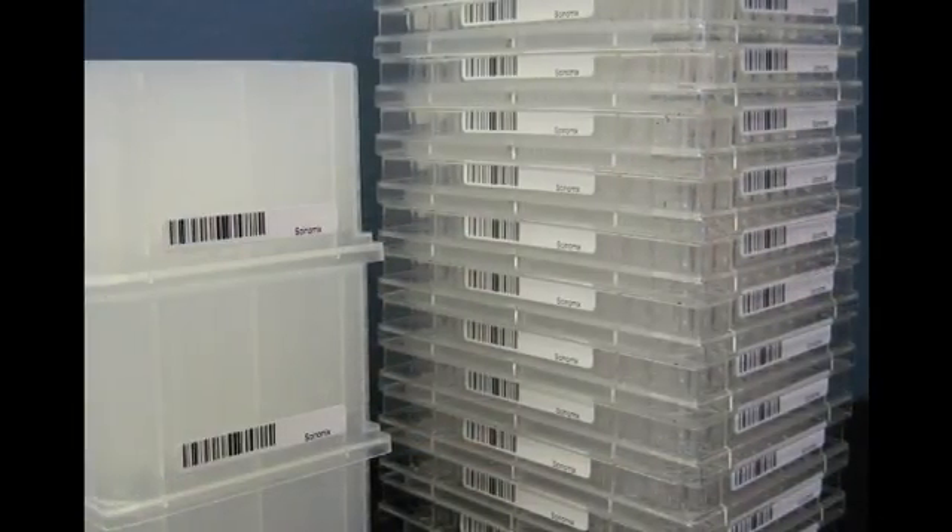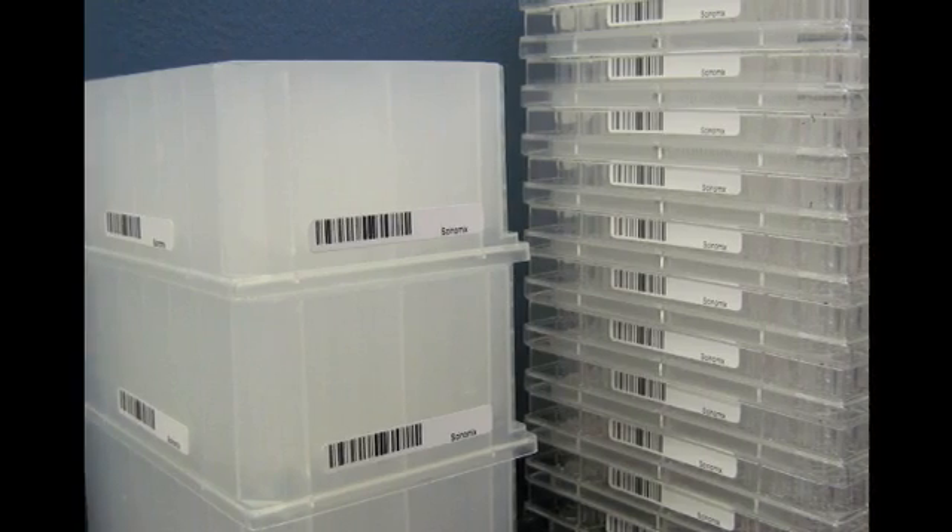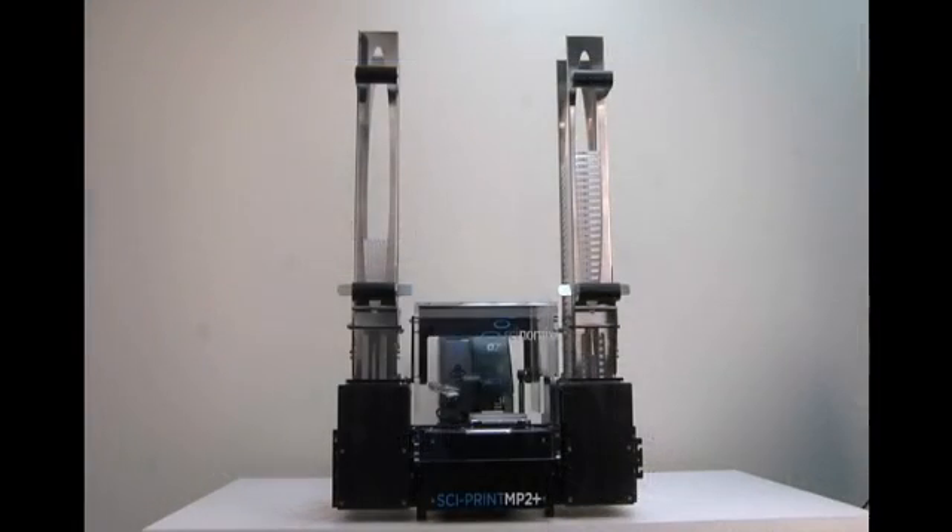With its ability to handle a wide variety of SBS footprint plates, ranging from microplates to deep-well blocks, the Cyprint MP2 Plus provides valuable walk-away time along with consistent and reliable label application.